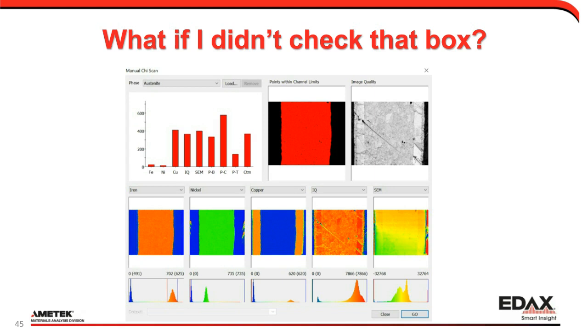You also can see those 2 bars. Those 2 bars define the area where I'm basically thresholding this data. In this case, I've thresholded that data, and I say, okay, here's my lower limit, here's my upper limit. These pixels I want to include. And I can do that for each one of these maps. Now I'm saying, okay, these irons in this area are included.